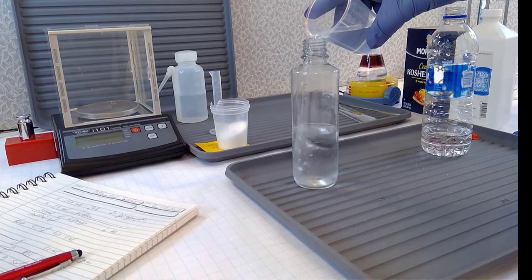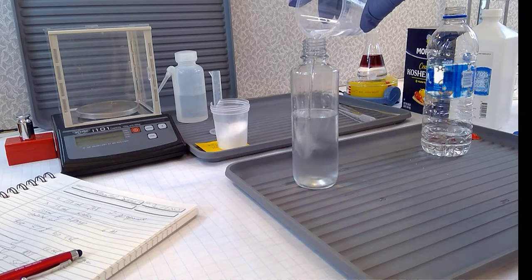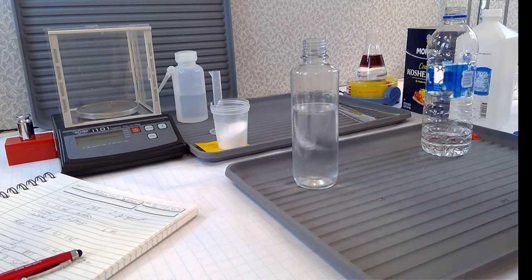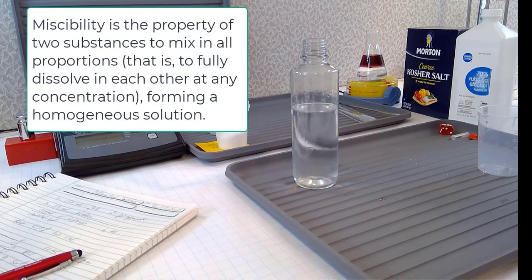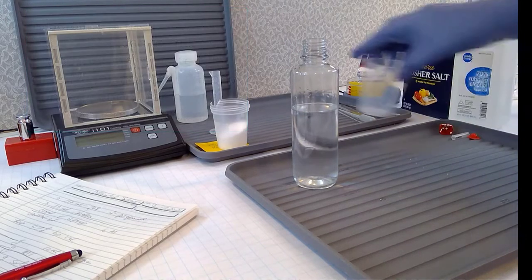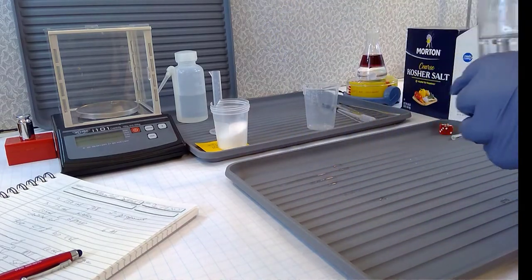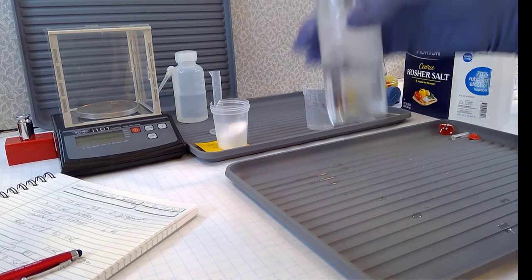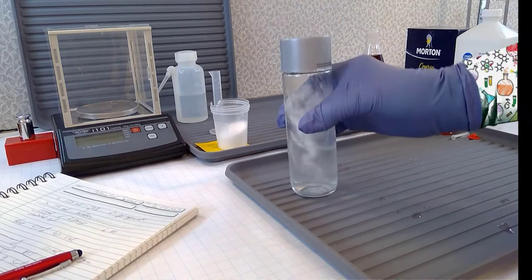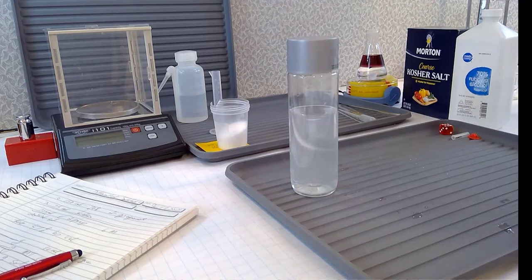Rubbing isopropyl alcohol, or 2-propanol, and water mix beautifully. In fact, they're referred to as being miscible, where you can mix them in any proportion and they'll dissolve. I mean, talk about the ultimate of dissolving, dissolvability, if there is such a term. And you've got it there. Let me put the cap on, mix these guys up, and make sure we've got a homogeneous solution where no little pockets of the rubbing alcohol and water are separated. Give it a little vortex there. Okay, good. That's mixed nicely.